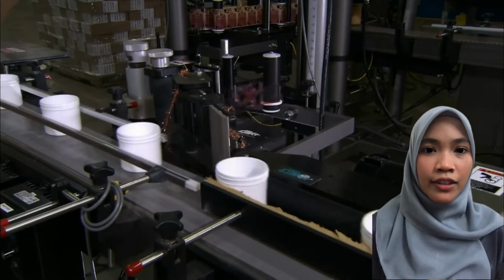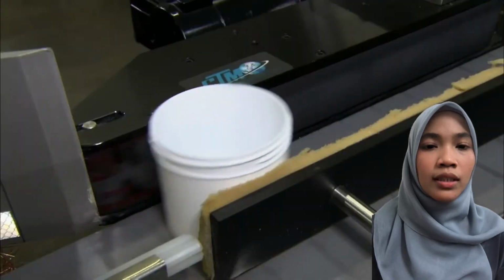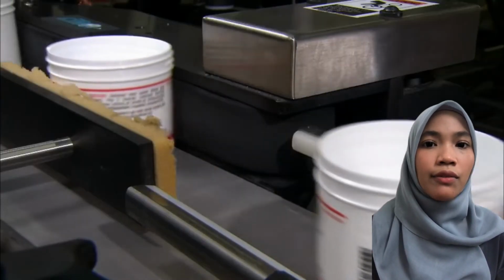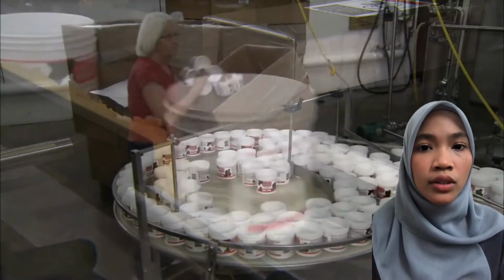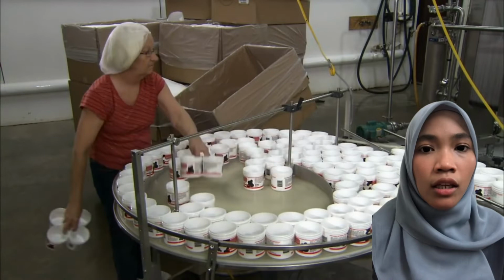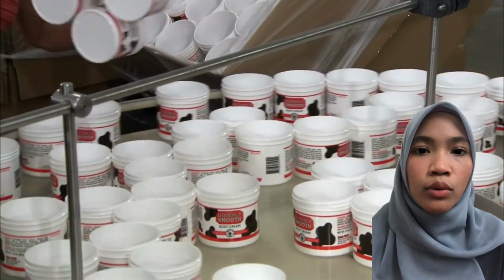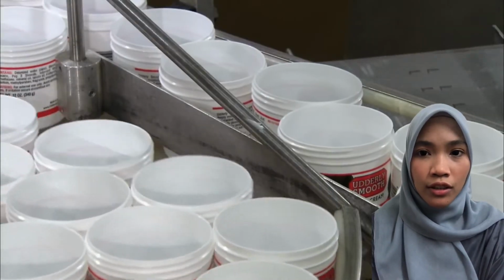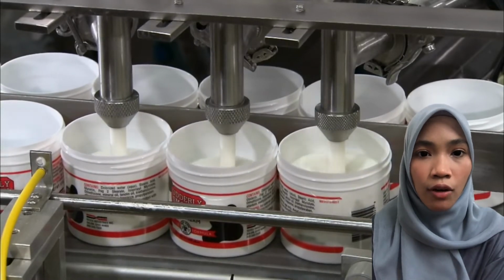Flash chromatography is suitable for the purification of high quantities of both synthetic and natural products. It is an ideal technique for rapid fractionation of crude extract or coarsely purified fraction. When we use flash chromatography, our main goal is to reveal the most active fraction in the mixture so that we can correlate their bioactivities to the molecules that they are made of.